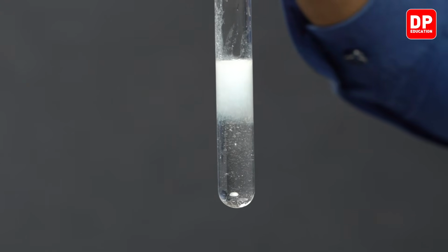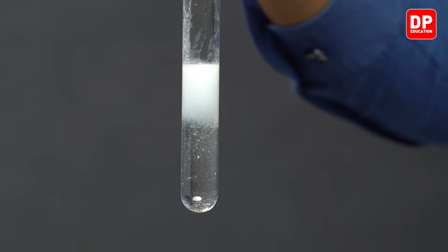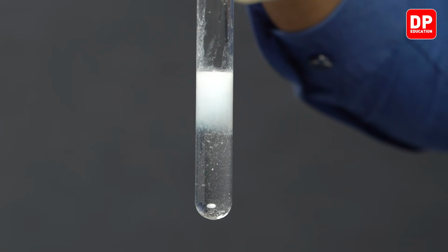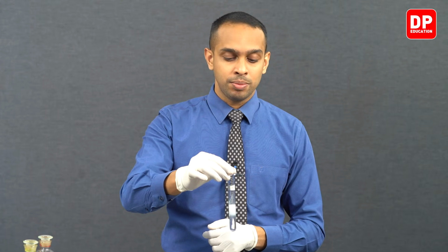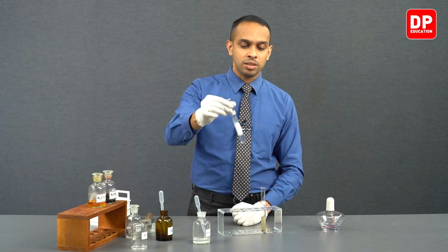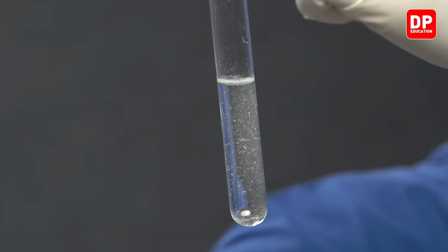Does it change its color like silver thiosulfate did? No. Silver thiosulfate readily turned into silver sulfide, but lead thiosulfate, which is a white color precipitate, does not decompose to form lead sulfide readily. When you heat this reaction mixture, you can see the lead thiosulfate turning into lead sulfide, forming a black color precipitate. So let's move on to that. We can first of all mix this really well. When you mix it, you can see the precipitate gets dispersed further.